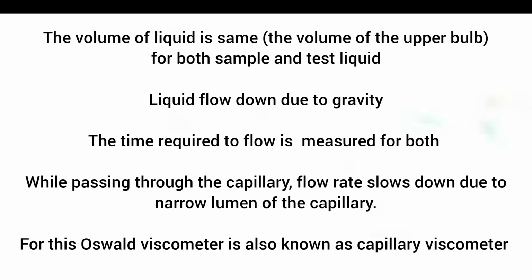So, the viscosity of water is available from the database at different temperatures. It displays the viscosity of water that is known. The density of water is also known because there are standard databases. The sample liquid is the unknown. Its density can be easily measured using a specific gravity bottle, that is experimental data.